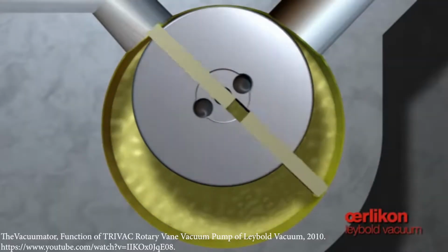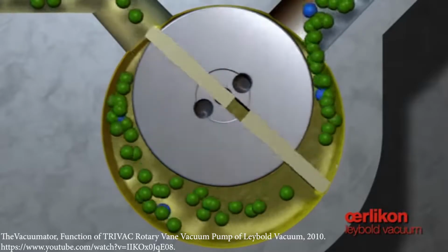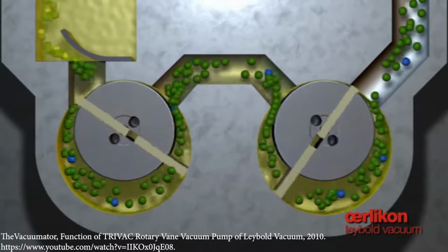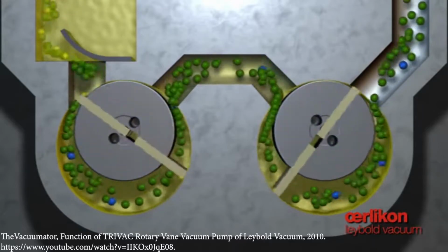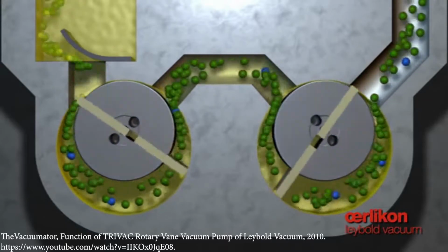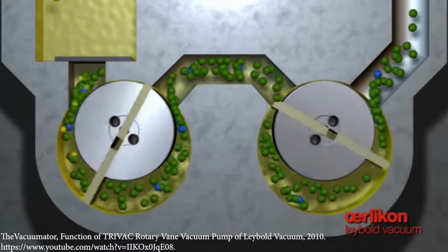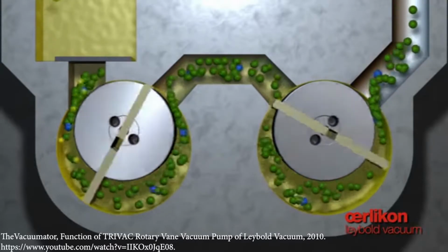So you have to have a pump that is able to work at atmosphere and pull some of the gas out of the chamber, pull some of the gas out of the instrument. This is called a rotary vane pump. Any pump that gets you down to those first initial pressures, we're just going to call a roughing pump. And it's just sort of a spinning turbine that seals and pulls gas out of the chamber and then blows it out into the room through that diaphragm there. This one is a dual rotary vane pump, but you just have to have these. The role of the pump is called a roughing pump. So it gets you from about 1 atmosphere, or about 760 torr, down to maybe 1 or so torr, but it depends on the dimensions of the instrument and things.